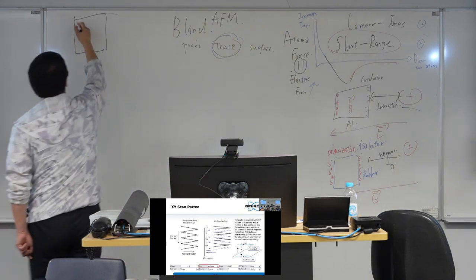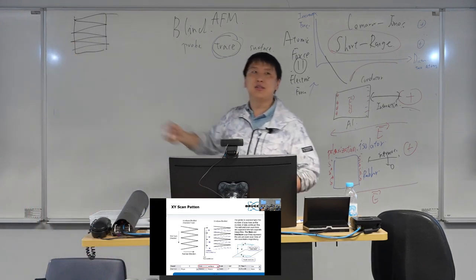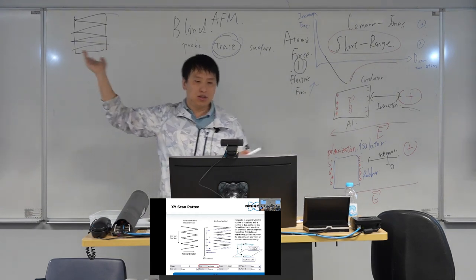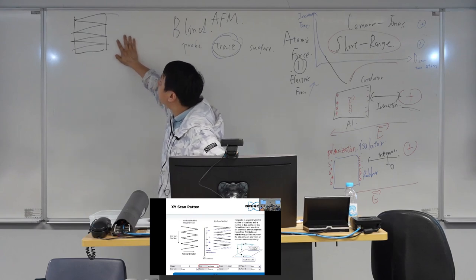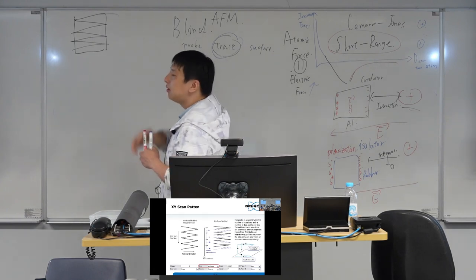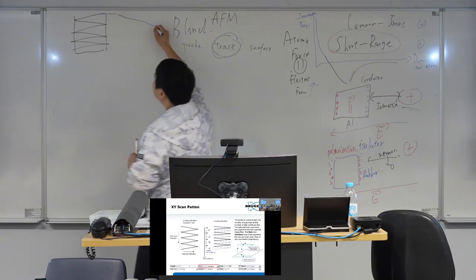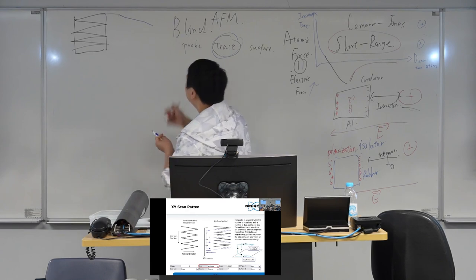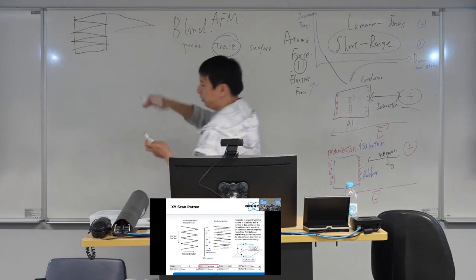The raster scan is scan back and forth, back and forth, back and forth. And then we get the surface. This kind of scan is the same as the screen, television, everything is using this kind of raster scan. So every raster scan has two lines. It will be a trace moving from left to right, and there will be a retrace. We get the back, forth, back, forth.